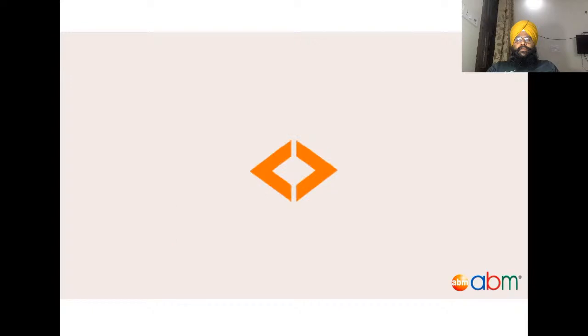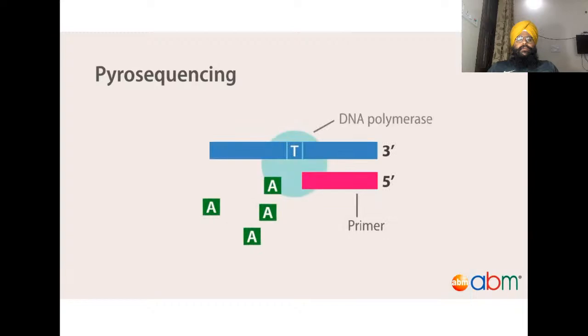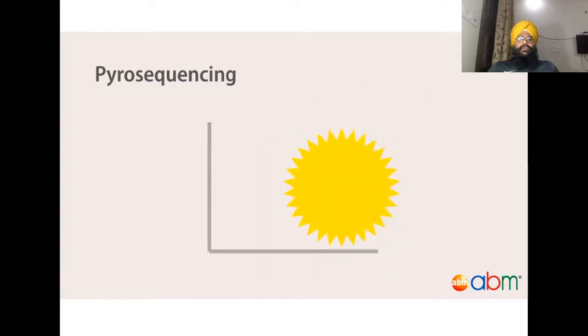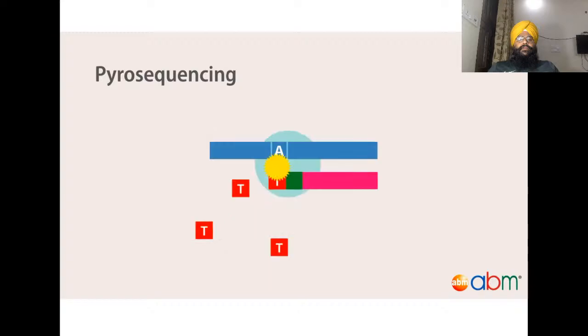In pyrosequencing, the sequencing reaction is monitored through the release of a pyrophosphate during each nucleotide incorporation. The released pyrophosphate is used in a series of chemical reactions resulting in the generation of light. Light emission is detected by a camera which records the appropriate sequence of the cluster. The sequencing proceeds by incubating one base at a time, measuring the light emission, if any, degrading the unincorporated bases, and then the addition of another base.